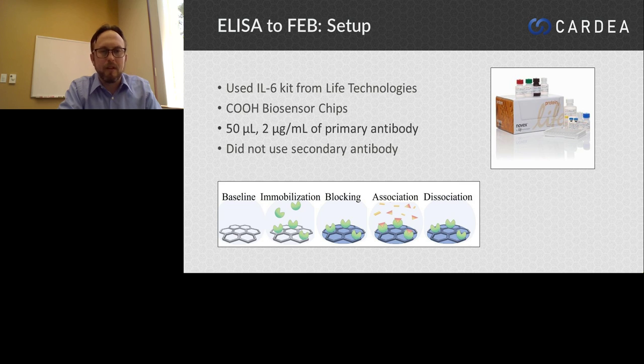We used small amounts of material for this. The important thing here is we didn't use the label. We used about half the reagents of the IL-6 kit, but we were trying to get the same result. We also wanted this to happen in 15 minutes instead of the usual several-hour measurement.